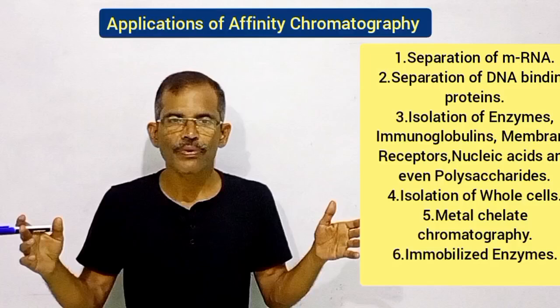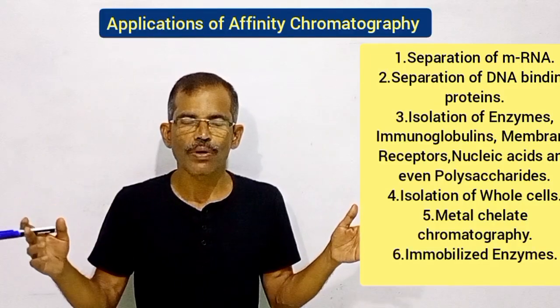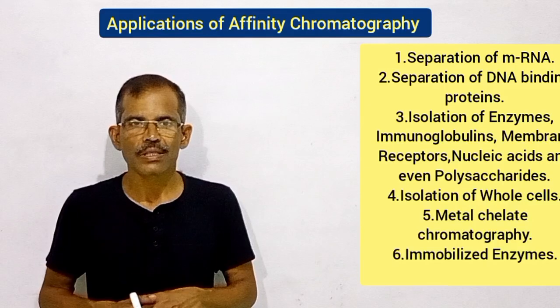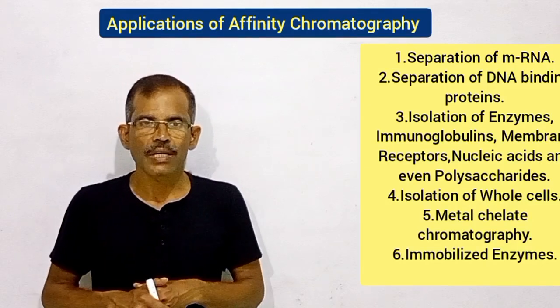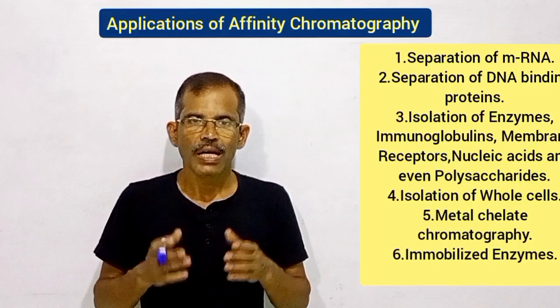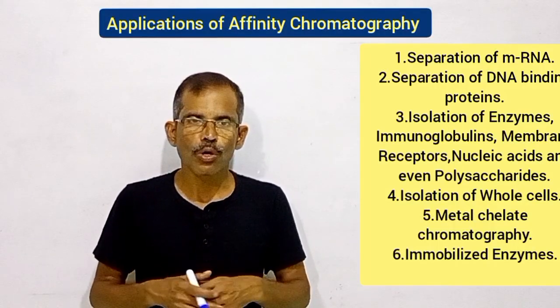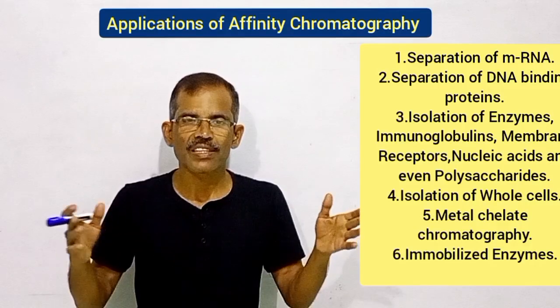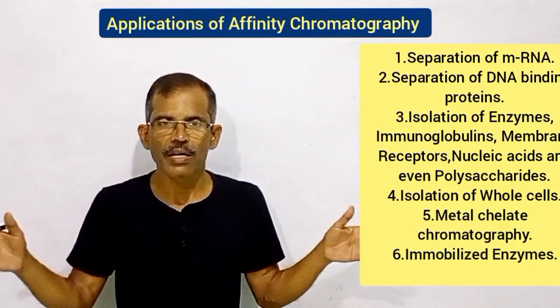Number 2. Affinity chromatography has also been used for the separation of DNA binding proteins. Number 3. This technique is useful for the separation of enzymes, immunoglobulins, membrane receptors, nucleic acids and even polysaccharides.